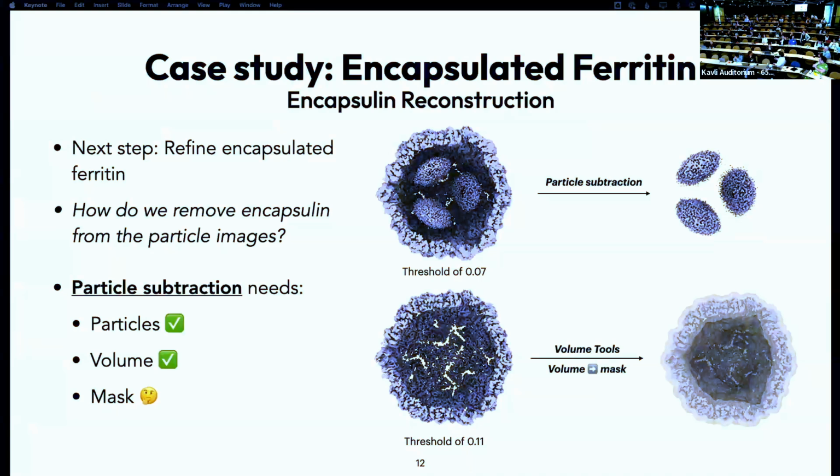Good question. Thanks. Just another thing regarding this long process where you resolved the ferritin structure. I've heard some concepts, I think it's called local symmetry, where you use a few operations to move all those subunits together. Is it similar or essentially the same as what you did here?